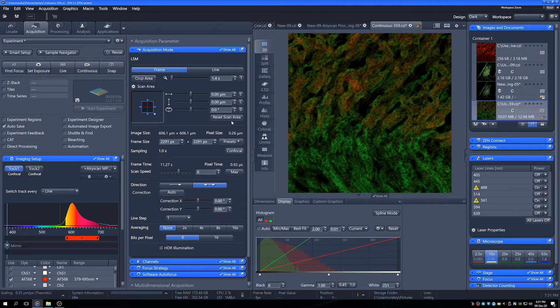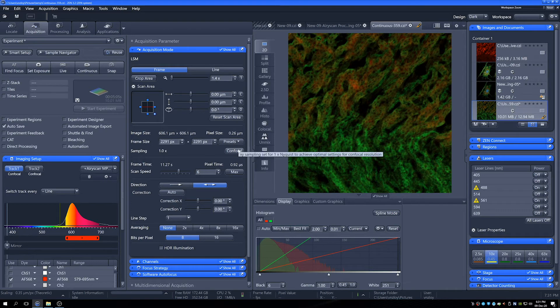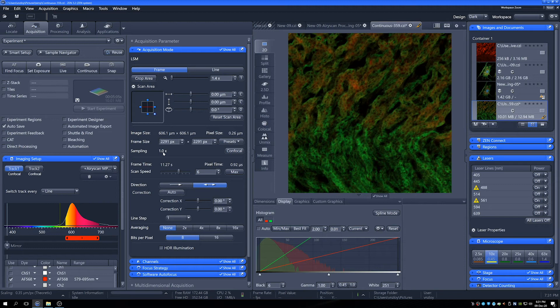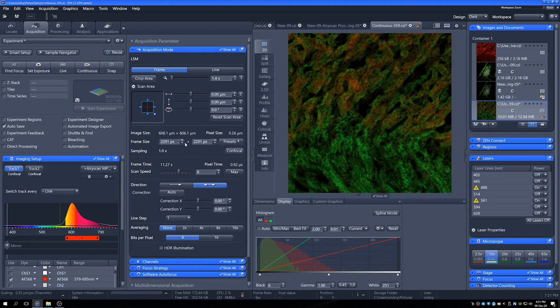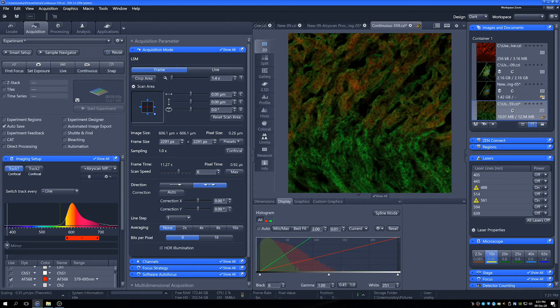To start with, we are already actually sampling properly. So we're already at confocal sampling, at times one sampling. But we can see here that we've got quite a big frame and quite a lot of pixels that we're collecting at the moment. So we might want to maybe crop the area unless we want a large field of view. Really depends on what we're doing.